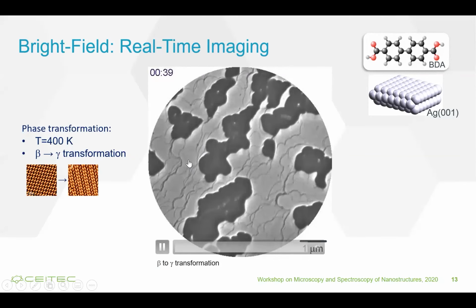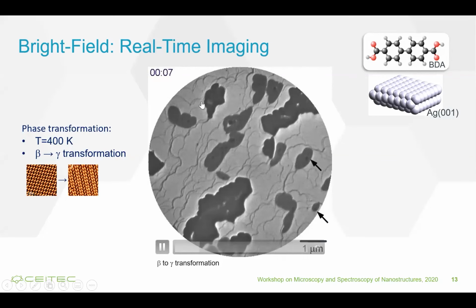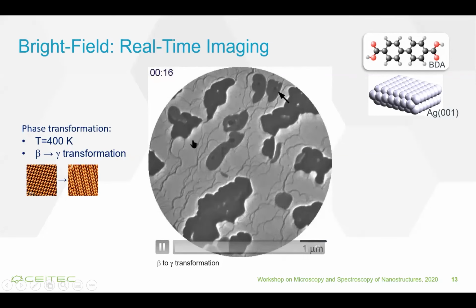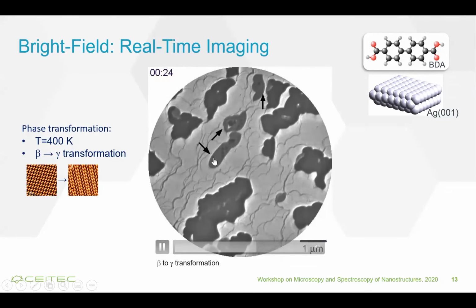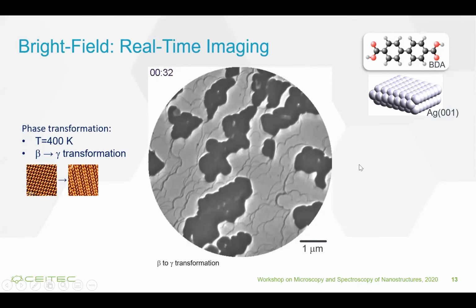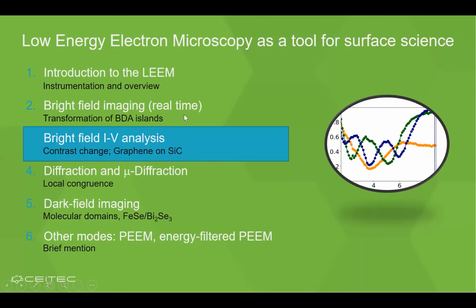with increasing temperature, you see again, the islands are diminishing, the molecules are evaporating to the surface gas. And then once this nucleus of the new phase is exposed to the surface, it quickly grows from the available molecules in the molecular gas. So then we can do more.